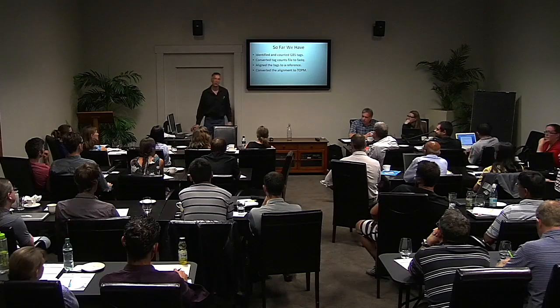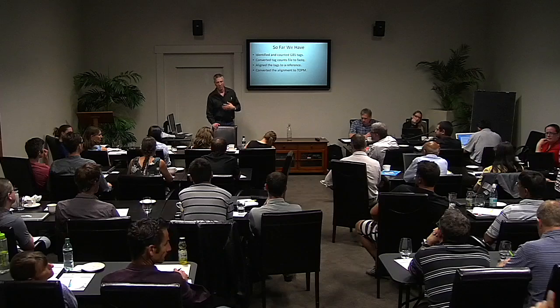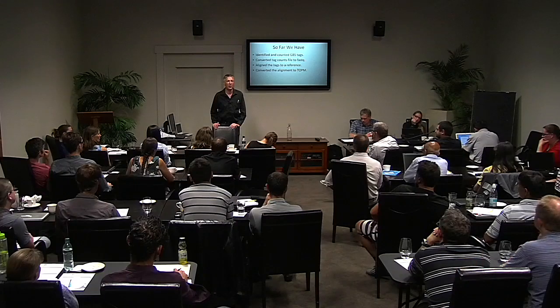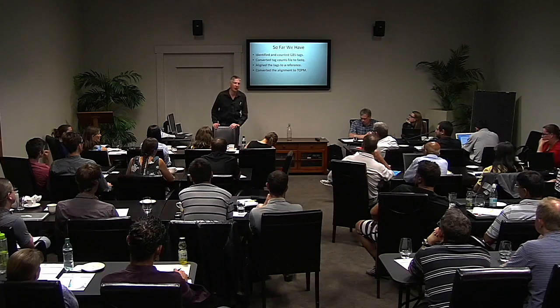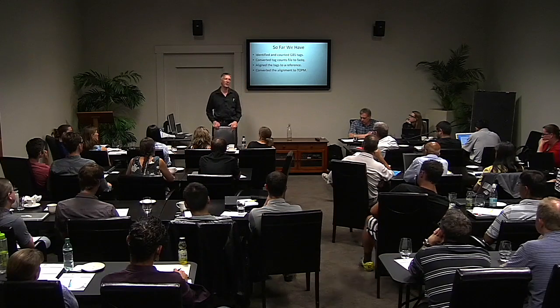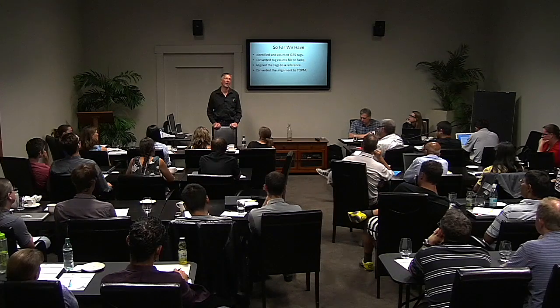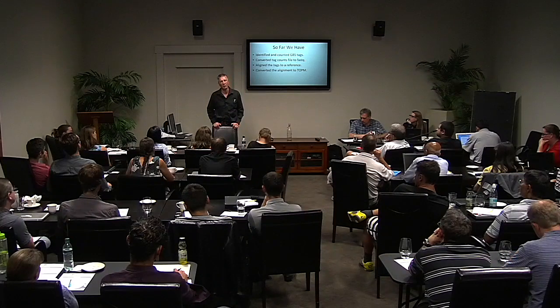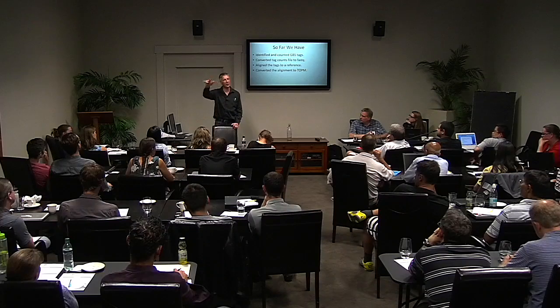John? Just double checking, at this stage you only allow one mismatch in those, we'll call it 6. No, thanks for bringing it up. The one mismatch thing would be the non-reference pipeline. We're not even thinking about mismatches here. We're just aligning to the genome.